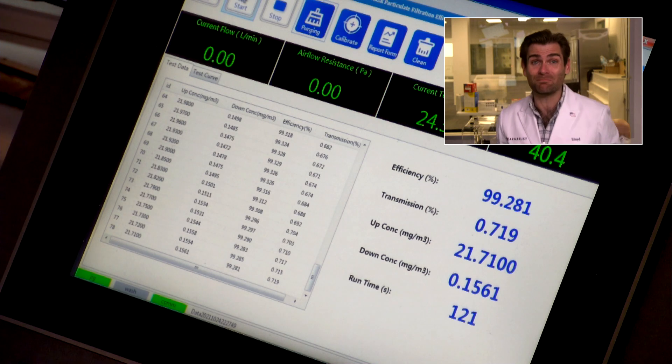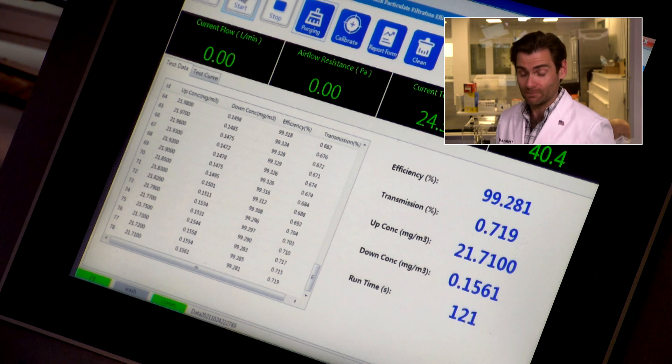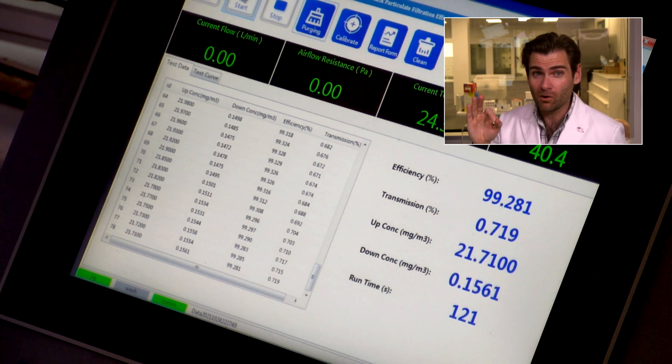The machine reads 99.281% — this is probably one of the best kids masks I've seen. Breathability is 147 pascals, which is just under the mark. I like to see under 150 pascals; it'd be great if it were lower for a kid, but honestly this is my number one kids mask right now. The Bluna KF94 — if you're looking for a kids KF94 on Amazon, this is the one I'd buy. It's blowing me away.